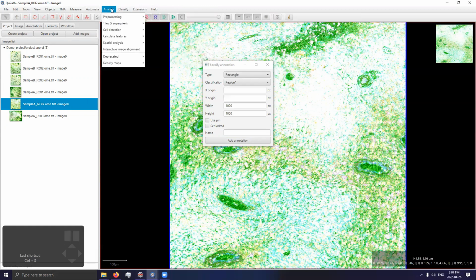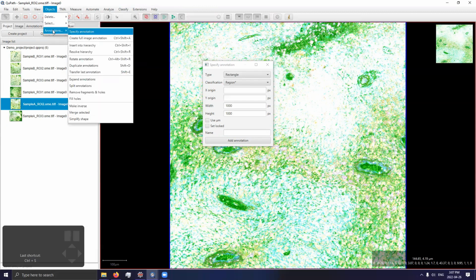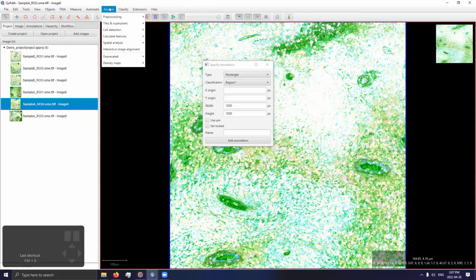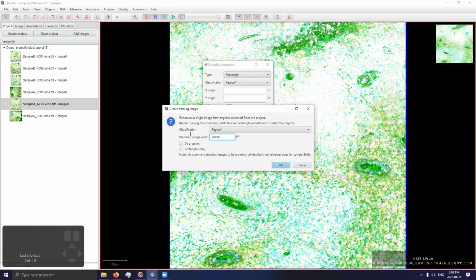So we can go ahead and go to, let's see, where would this be under training images? We would create a training image. Because we have 4 images and we know that the side length of an image is 1,000 pixels, why don't we make it 2,000 by 2,000?